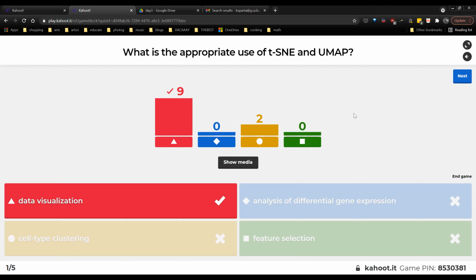They have an almost completely randomized topology at the local and global level. While it preserves some sort of structure, it's not appropriate to do cell type clustering on this two-dimensional distance space.